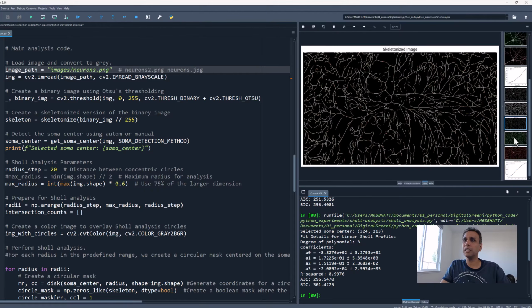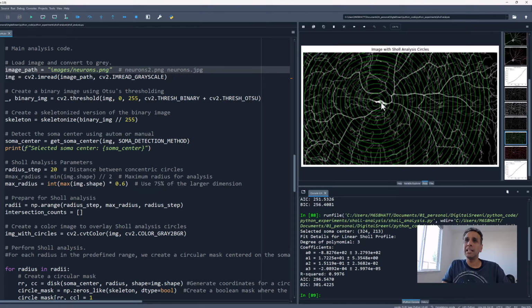If I can click on it, where is it? Right there. The actual one is right here. Still, the brightest pixel is very close by in this specific case, but it's not really exactly on it. And yeah, so this is the challenge when you have different images of different sizes.